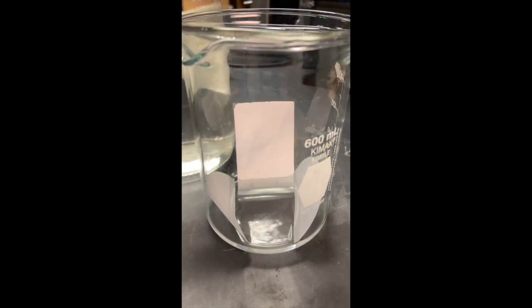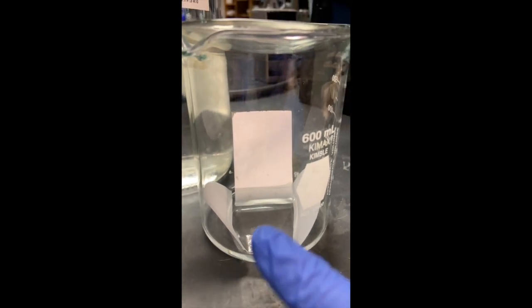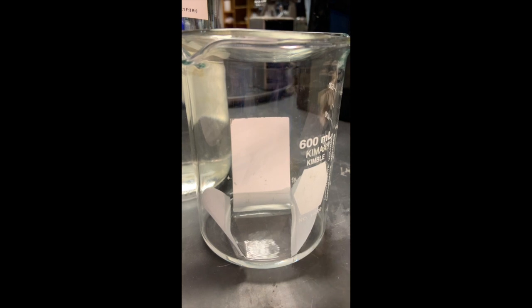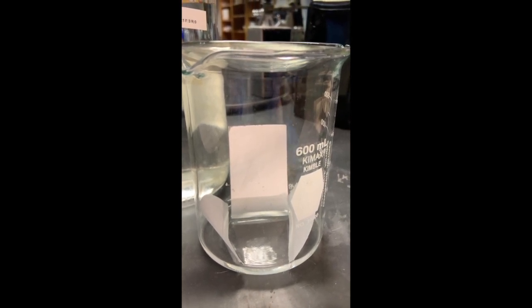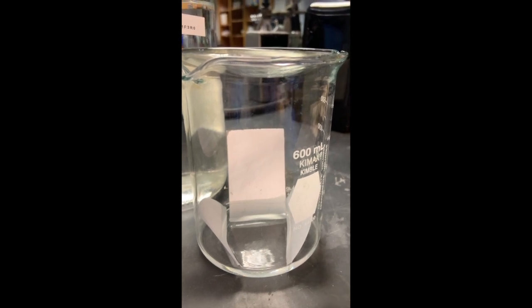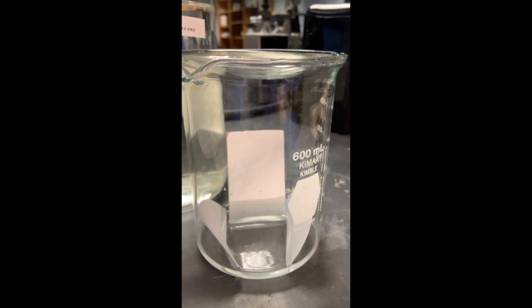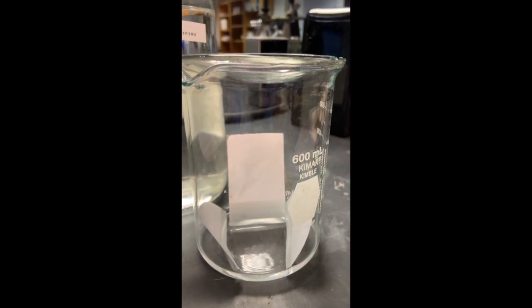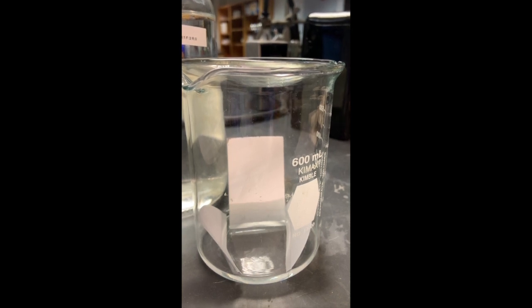I tried to quickly take a photo as soon as I put the TLC plate in to show you that my solvent was below my origin line, and it's quickly rising, so I had to be really fast about taking the picture. Luckily the solvent was far below my origin line, and so now I put the watch glass on top and I see this 1% acetic acid and ethyl acetate slowly rising up on my TLC plate.